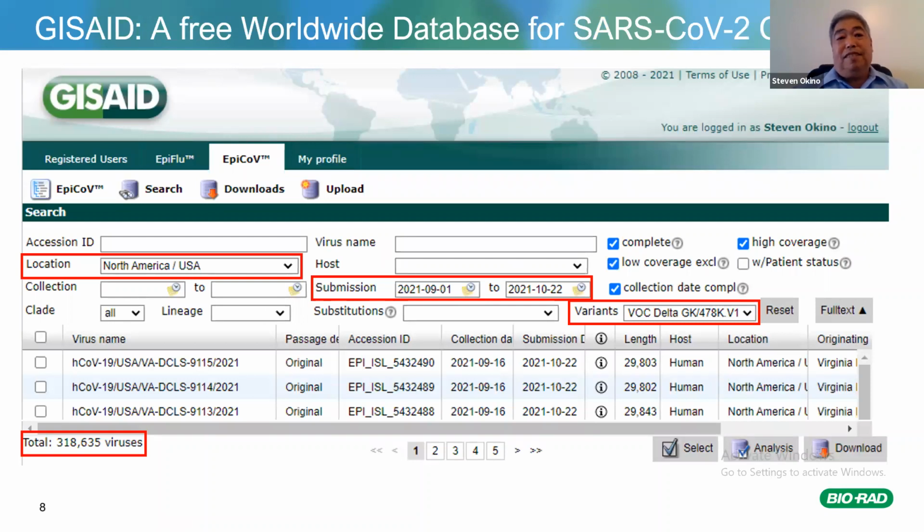So this is what you see. This is GISAID, the free database of SARS-CoV-2 viruses. This is actually what a lot of the SARS-CoV-2 epidemiologists are using right now. And I've got to say, it's really great. So what I did here is, suppose they want me to go after the Delta variant. You have this box over here where you can specify, I want to go after Delta. So only the SARS-CoV-2 viruses corresponding to the Delta variant will be shown.